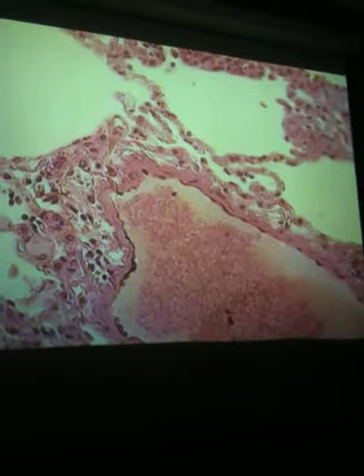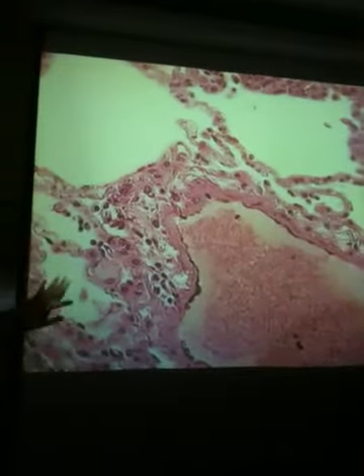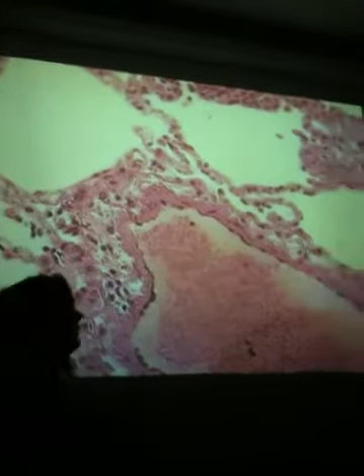What are all the white spaces? Those are the alveoli again. All of this area is the alveoli here and there. I'm going to remind you — what's the difference between an alveolar sac and an alveolus? Well, we don't need to know that on this exam. We just need to be able to find an alveolus.